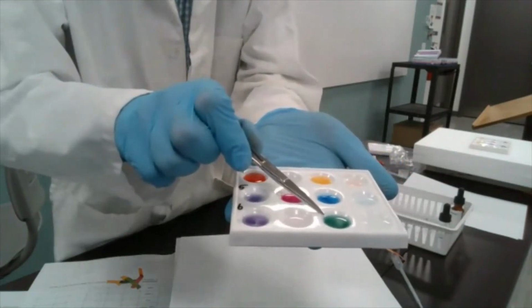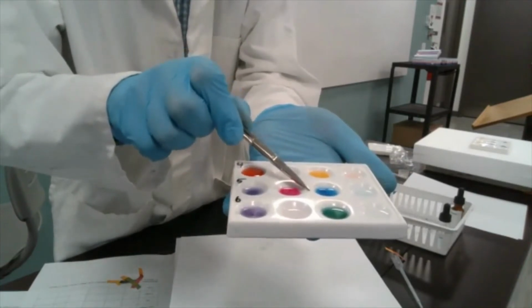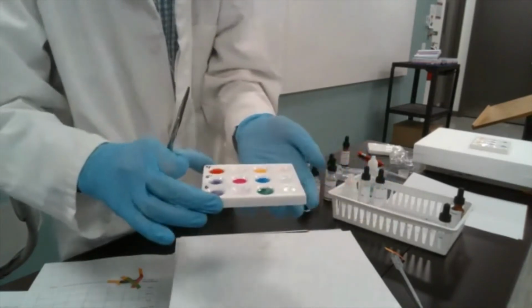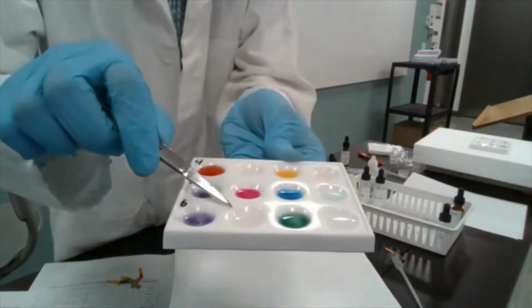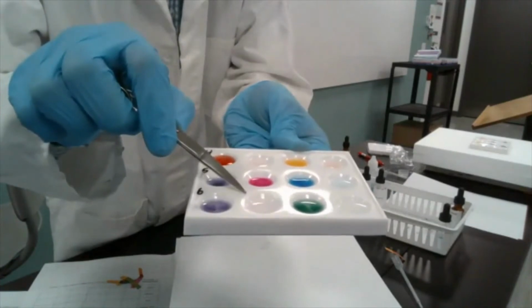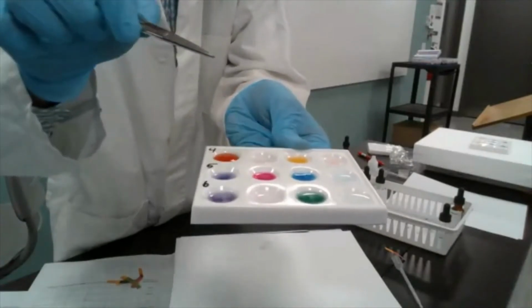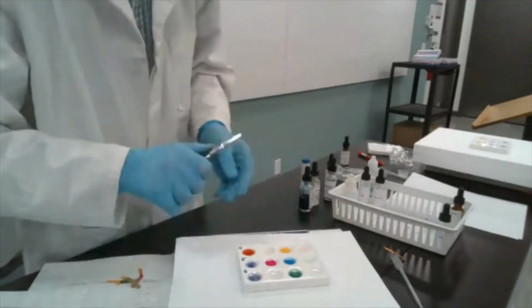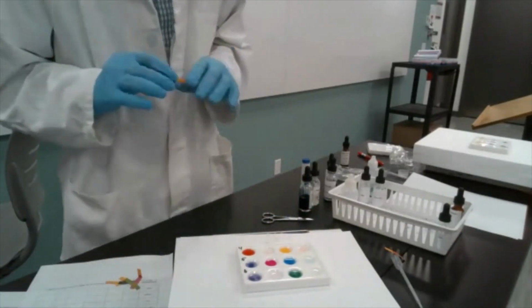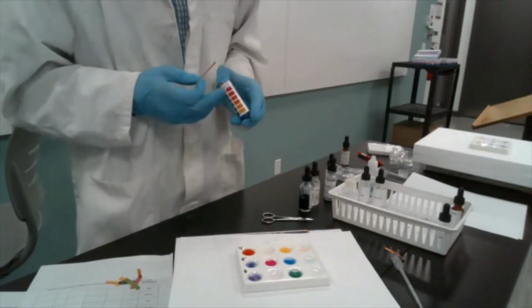So what this tells us is that pH-wise, we're somewhere in between the definite acid and the definite base. So we're somewhere in the middle there, and based on the slight pink color of the phenolphthalein, you probably can guess or make an educated guess whether we're closer to the base or the acid end of the pH scale with the soap solution. And finally, you can use pink for phenolphthalein or light pink, whatever, depending what you used previously for the sodium hydroxide and the glass cleaner.